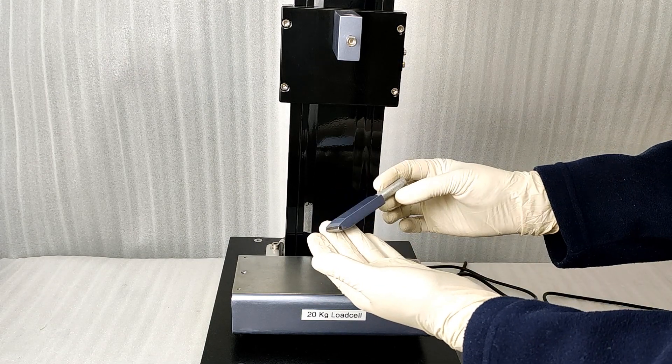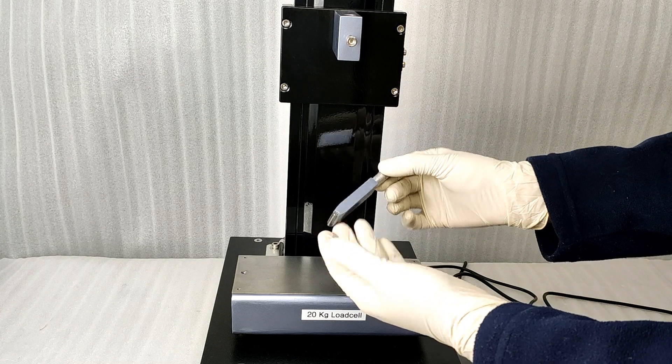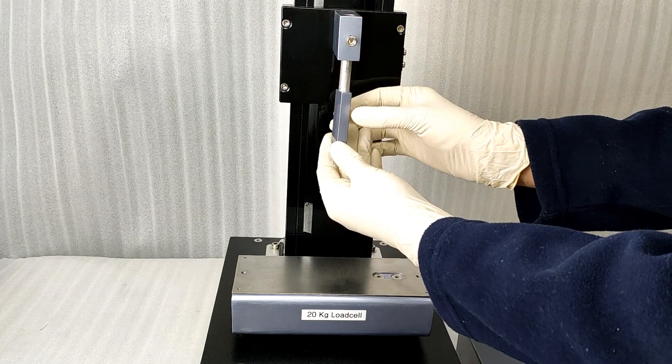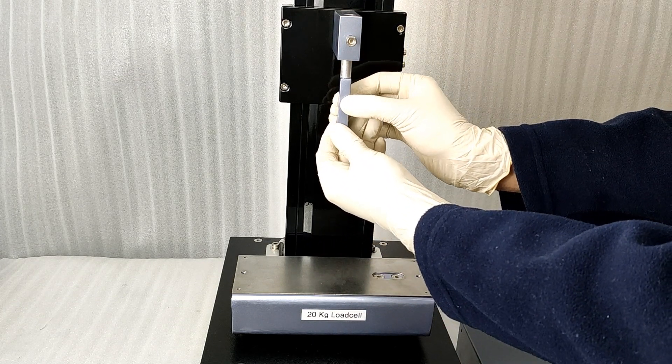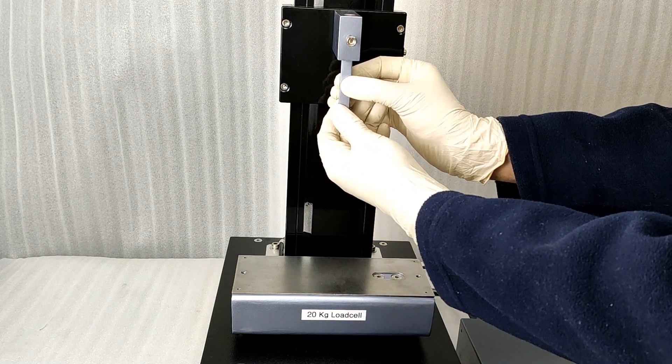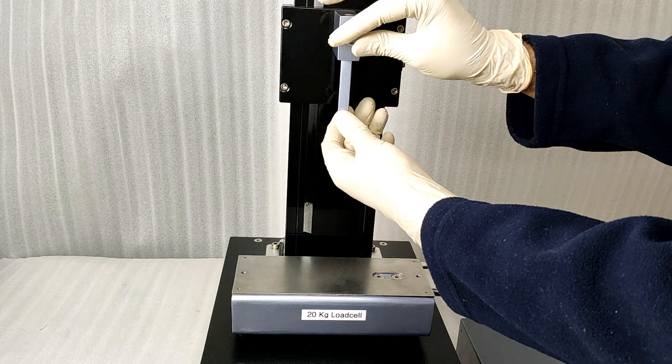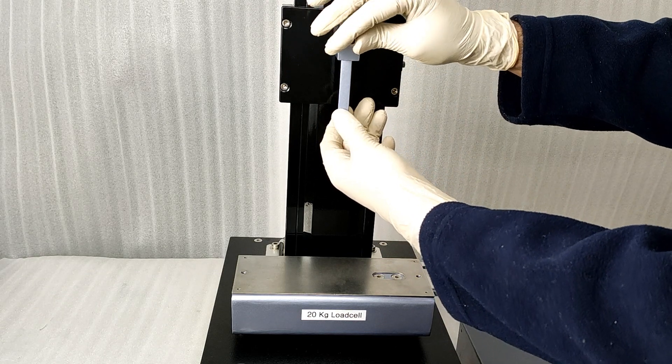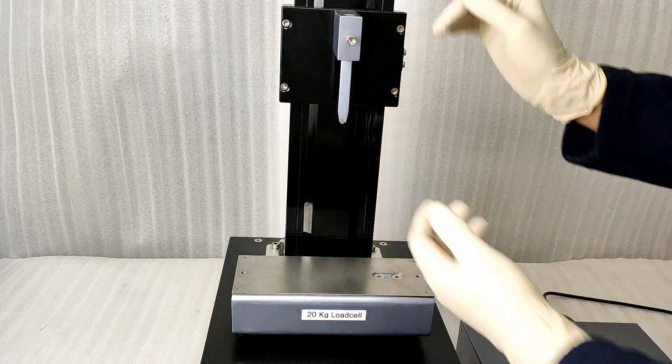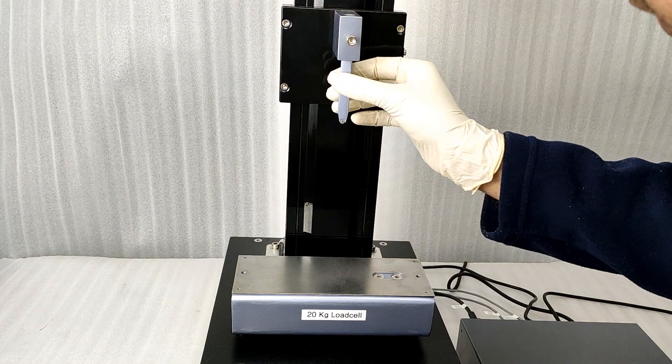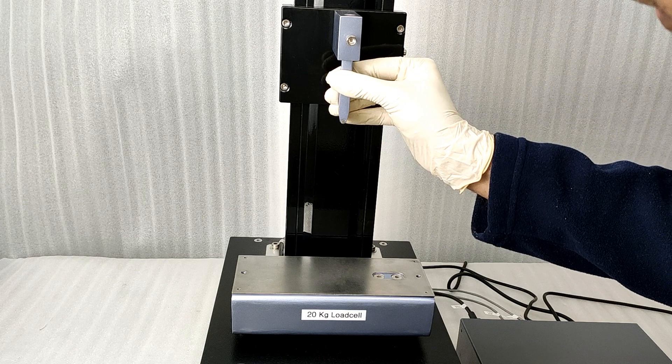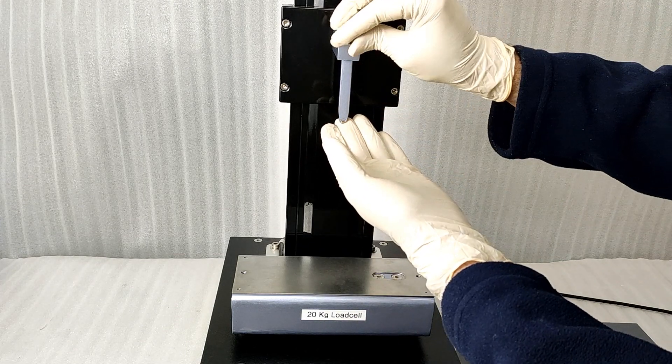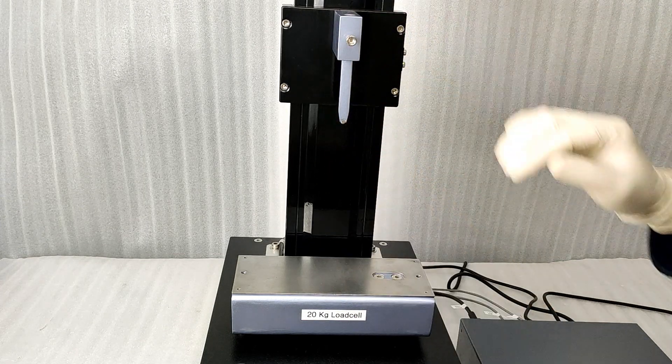Attach the wedge to the wedge holder as shown. Check alignment and make sure it is straight. Tighten firmly.